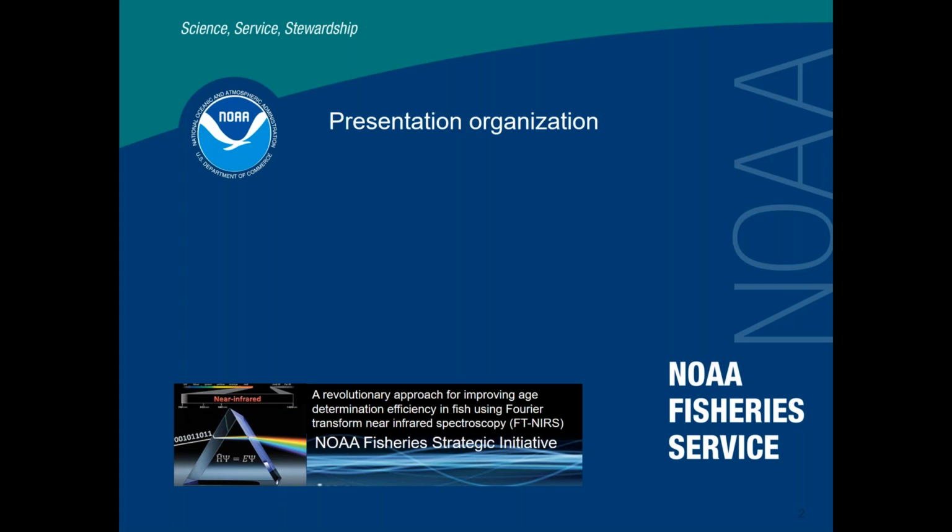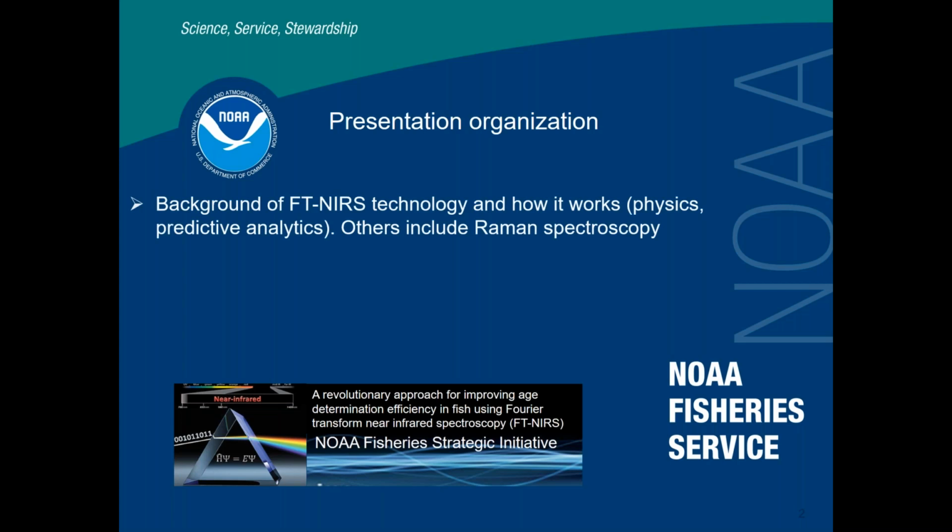The presentation I'm giving today is going to be organized into multiple parts. The first part, I'll be talking about the background of FT-NIRS technology and how it works, both in terms of the physics behind it and the predictive analytics. Just a note, we are also exploring other means of spectroscopy, such as Raman spectroscopy, to ground truth or use an additional tool in parallel to help us understand the relationship between the target properties of what we're scanning with this technology and what we're trying to estimate, such as life history parameters in particular.